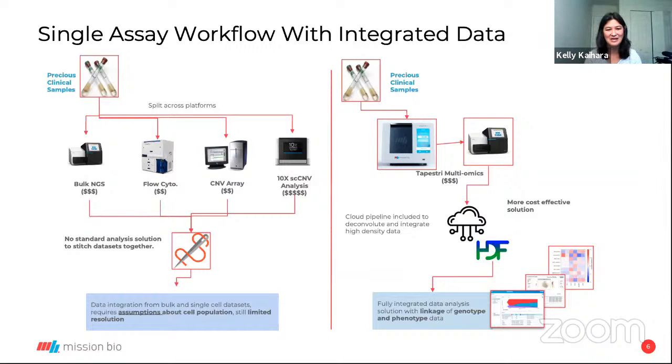To tackle all of that data, we've now switched to H5 files, which can handle information across all of these different parameters. We've worked really hard in the past couple of years to create software tools and data analysis packages to analyze these data, to make it easier for the customer to very quickly get very beautiful illustrations and visualizations of what's happening across all of these different readouts. Next slide.